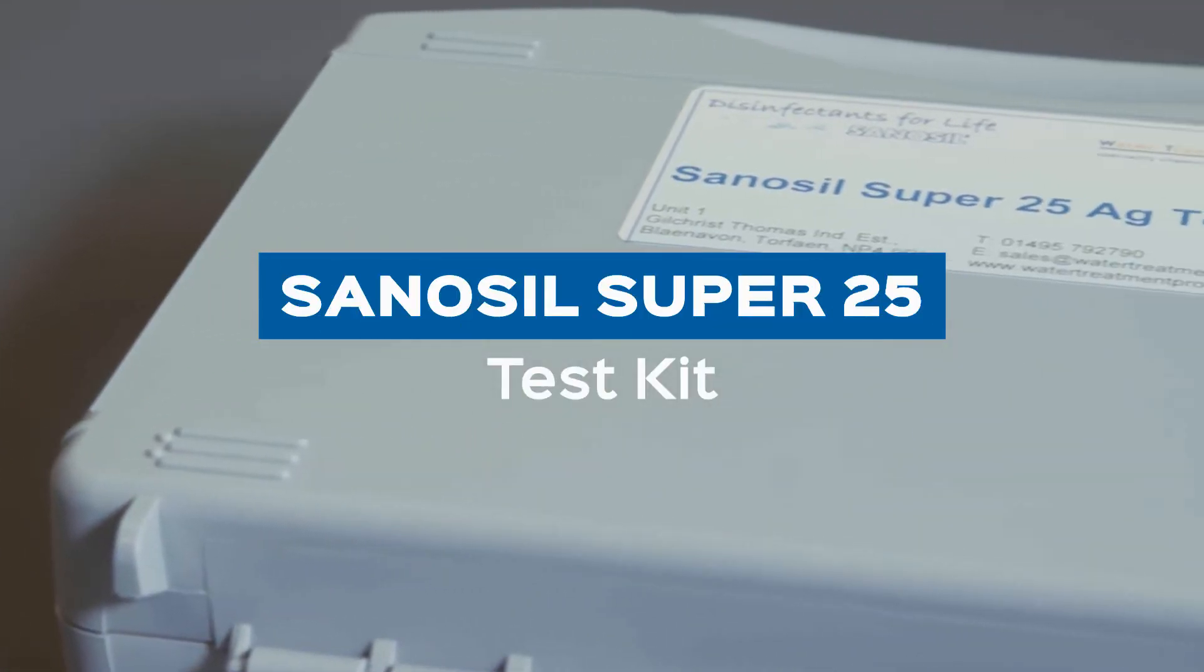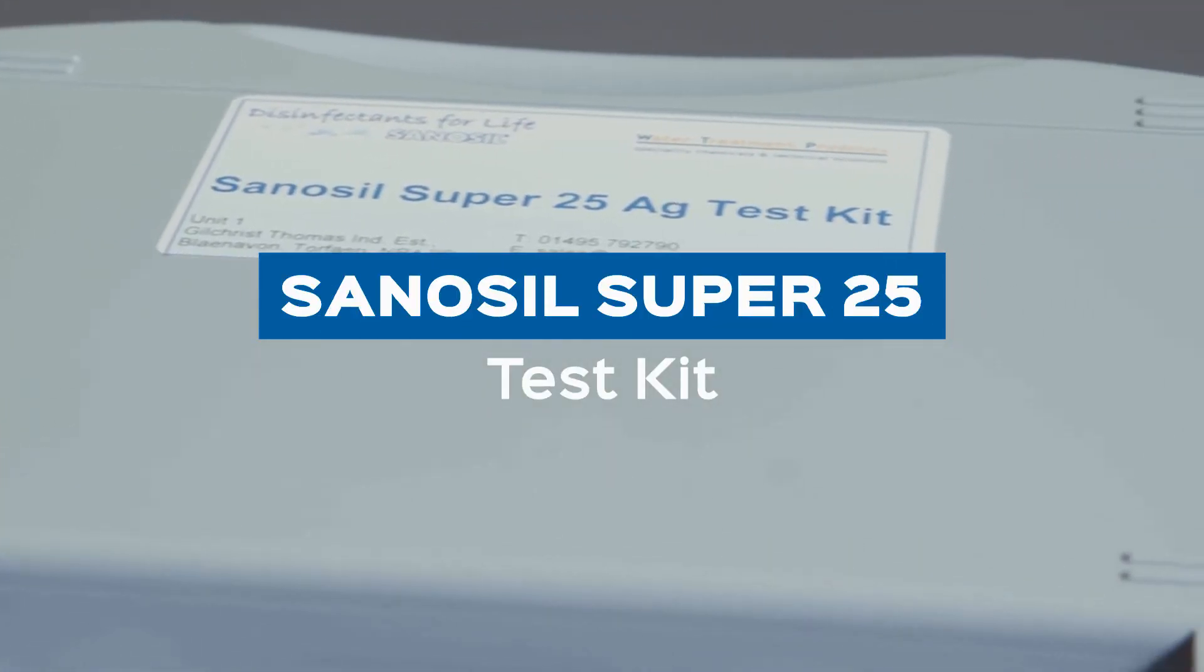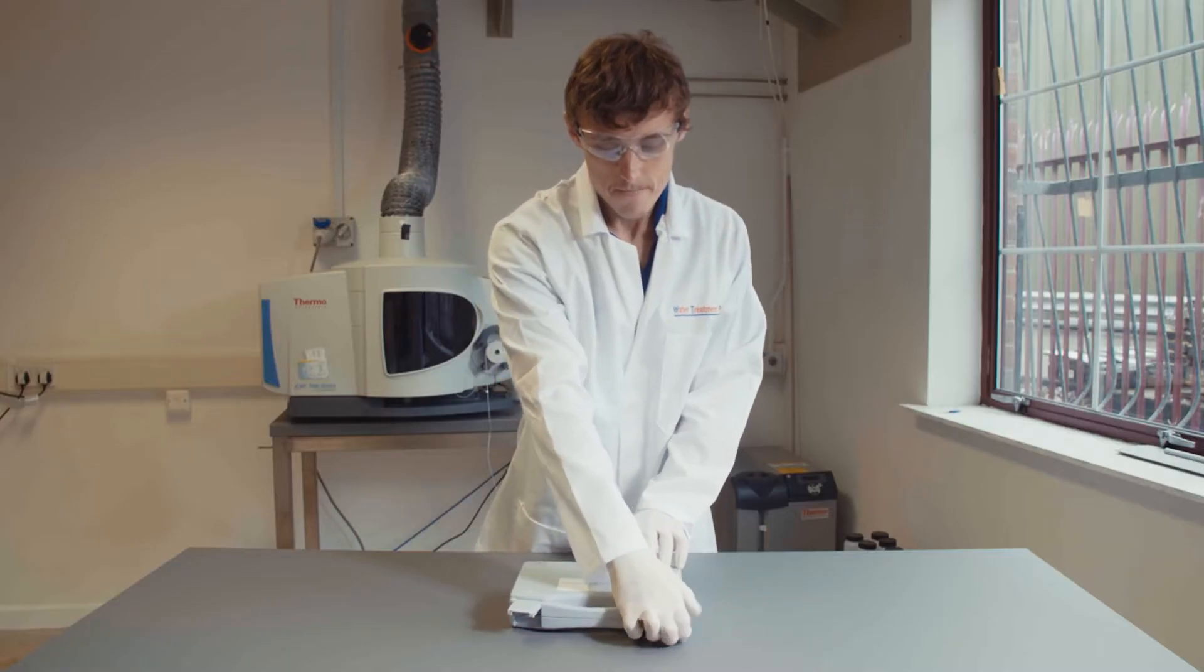This is an explanatory video for using the WTP Sanosil Super 25 drop test kit.